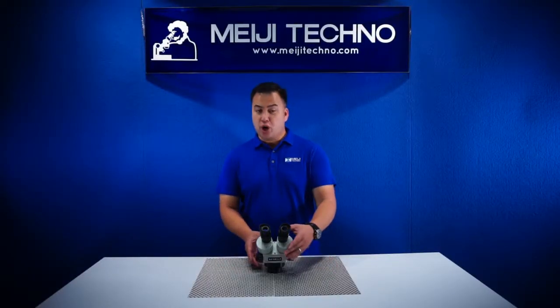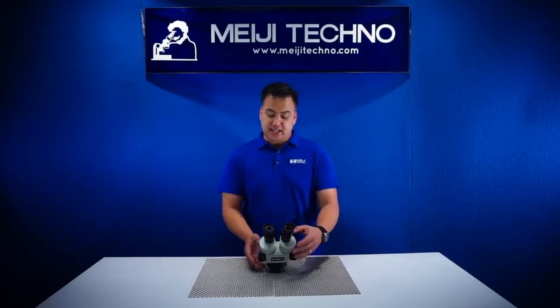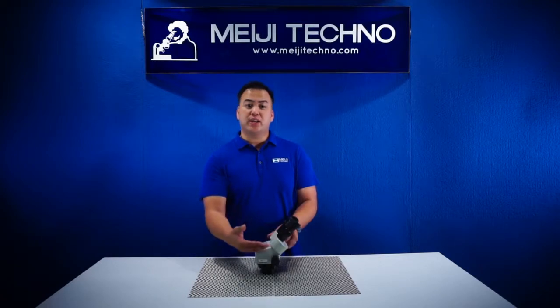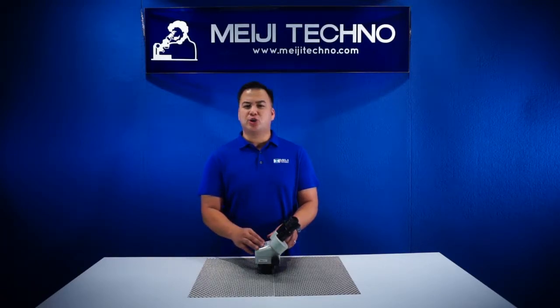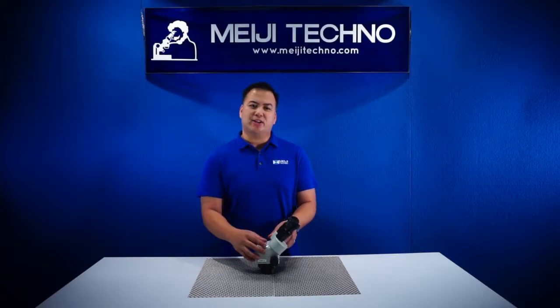From its ergonomically positioned bilateral smooth zoom controls and its binocular eye tube inclined at 45 degrees, the EMZ5 provides the user a fatigue-free viewing experience with its ergonomic eye tube angle.